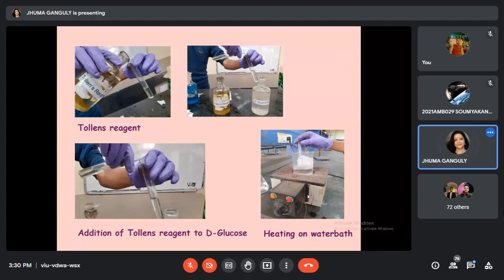Initially it will seem okay, because when you check it, it's working, but after one hour of heating maybe the problem will start, and the mantle will not work. So this type of thing will come up immediately, in the first batch at least, after joining.